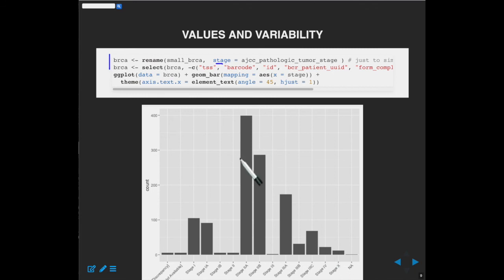And something's gone on here, because ggplot has computed how many of the 1200 samples belong to each one of these classes, right? Okay, and you can see really what we saw last time when we filtered out the weird stage guys, that there's not too many of those abnormal guys. The majority of them in our data set are really stage 2A, it's a huge class, and stage 2B, and there's fewer stage 4, etc.